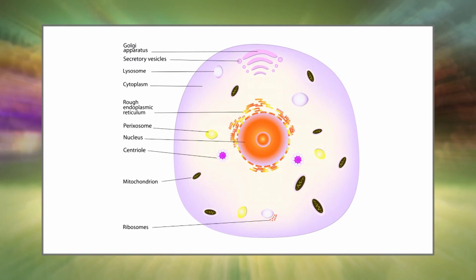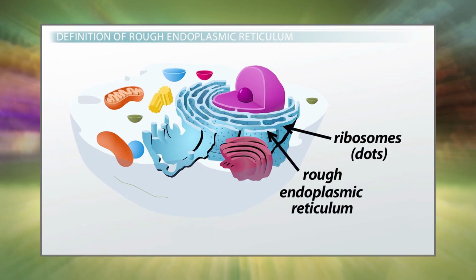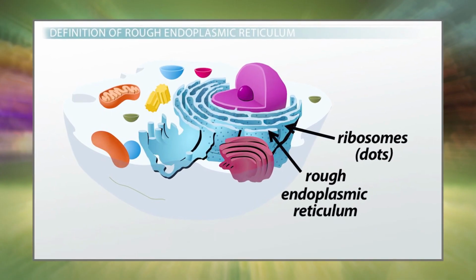These are two stains used in the examination of thin slices of biological tissue. Contrast is created by the stains, where hematoxylin turns the nuclei blue while eosin turns the cytoplasm as well as other parts pink or red. The hematoxylin is a basic dye that stains acidic components of cells a blue color. Hematoxylin stains the nuclei of cells and the RER of the cytoplasm. Eosin is an acidic dye that stains the basic components of the cell a reddish pink color.